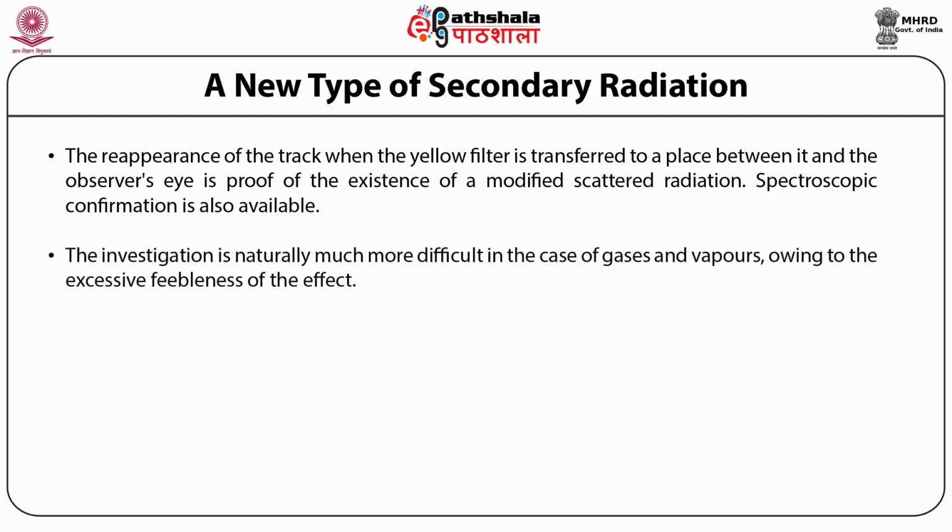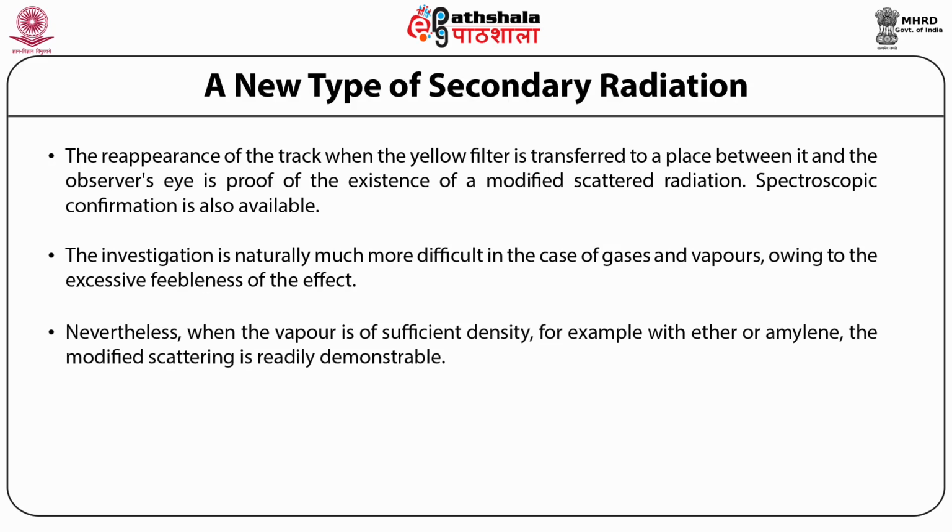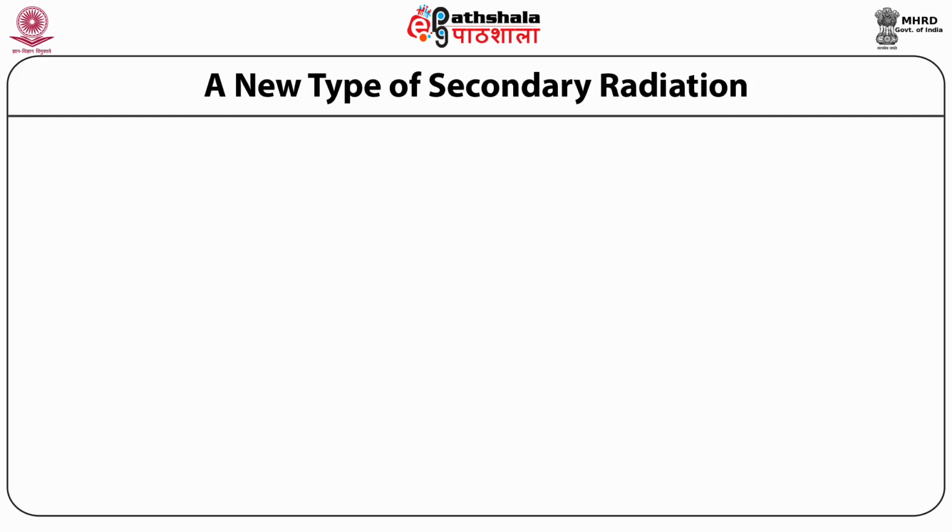The investigation is naturally much more difficult in the case of gases and vapors, owing to the excessive feebleness of the effect. Nevertheless, when the vapor is of sufficient density, for example with ether or amylene, the modified scattering is readily demonstrable. Professor C.V. Raman.